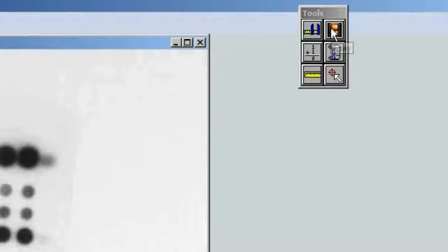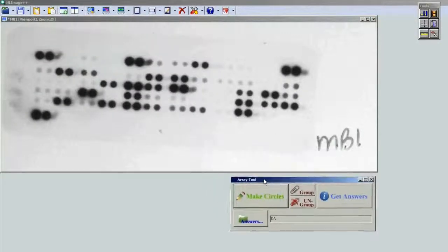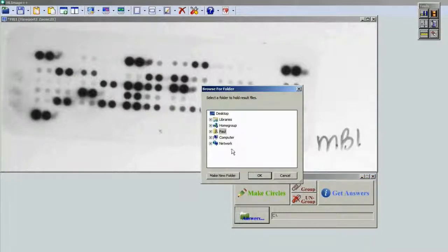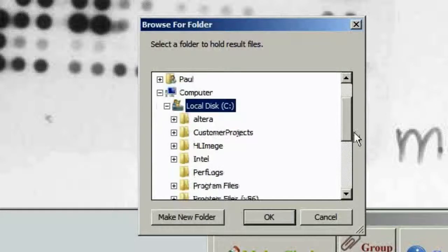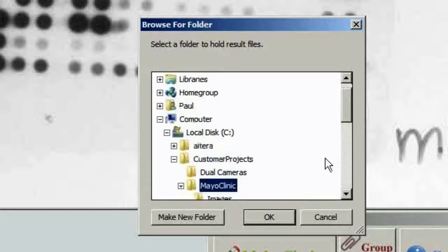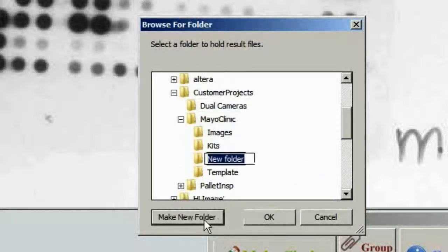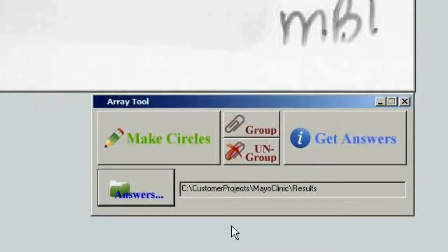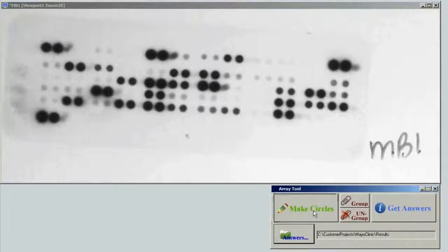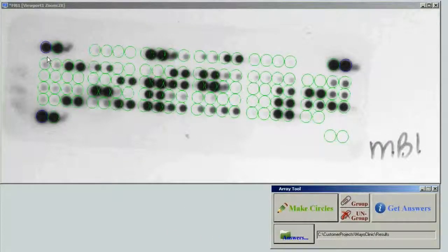Now we open the Array Analysis tool. The first thing to do is figure out where we want to put the results of our inspection. We click the Answers button and select the folder — in this case under Mayo Clinic, where these images came from, and select Results. Because the image already has a calibration object attached to it, all we have to do is click the Make Circles button, and the circles set themselves up according to the template.